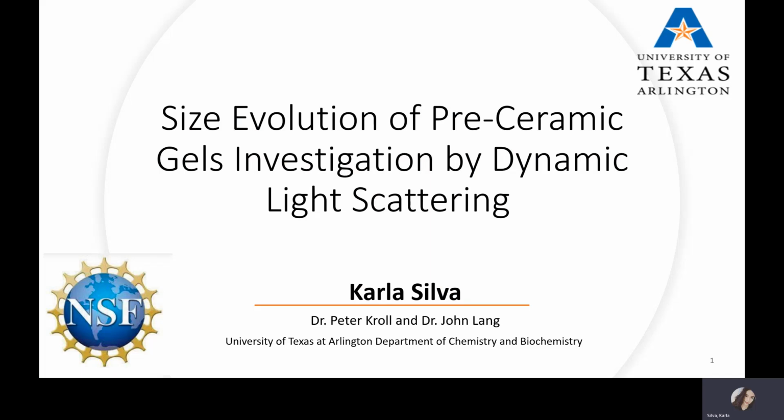My name is Karla Silva, and I am currently an undergraduate student at the University of Texas at Arlington. I have been working under Dr. Peter Kroll and Dr. John Lang for the past 5 weeks. And my project has been the size evolution of pre-ceramic gels investigation by dynamic light scattering.